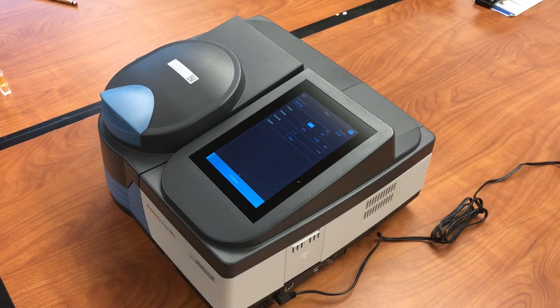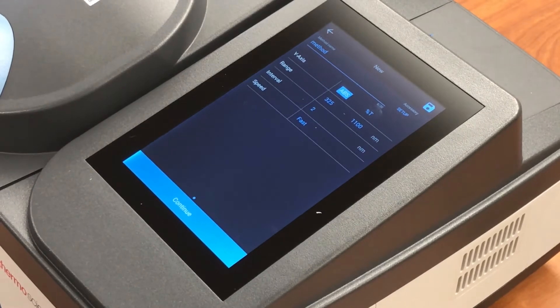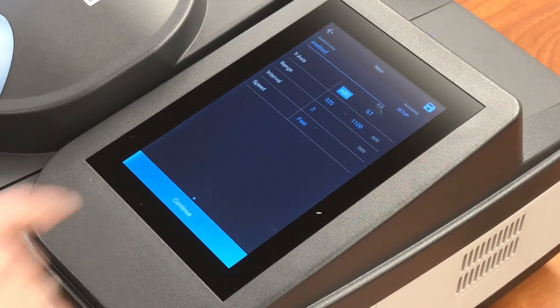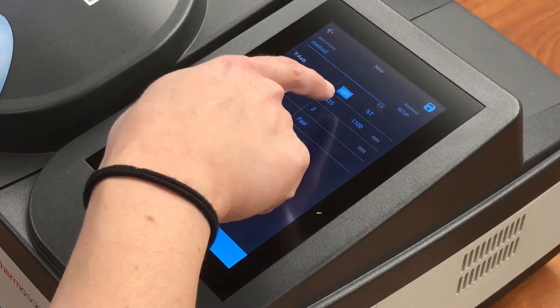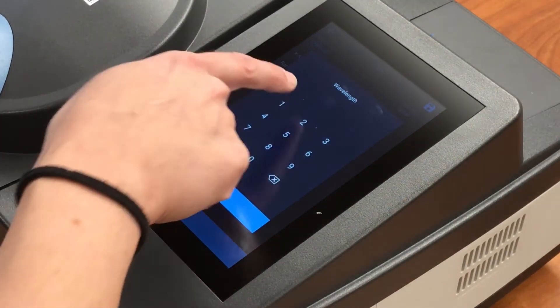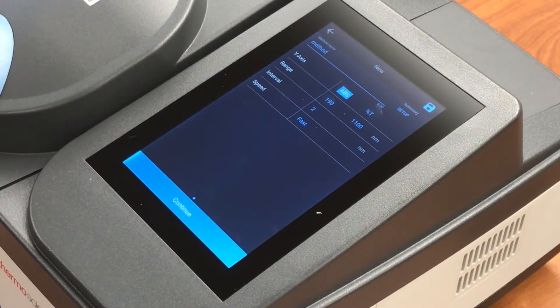You can select the wavelength range as well. I am going to be using some polystyrene cuvettes today, so I'm going to leave this range from 325 to 1100 nanometers, but you could go down to 190 nanometers if you're using the proper cuvettes, a quartz cuvette for instance.